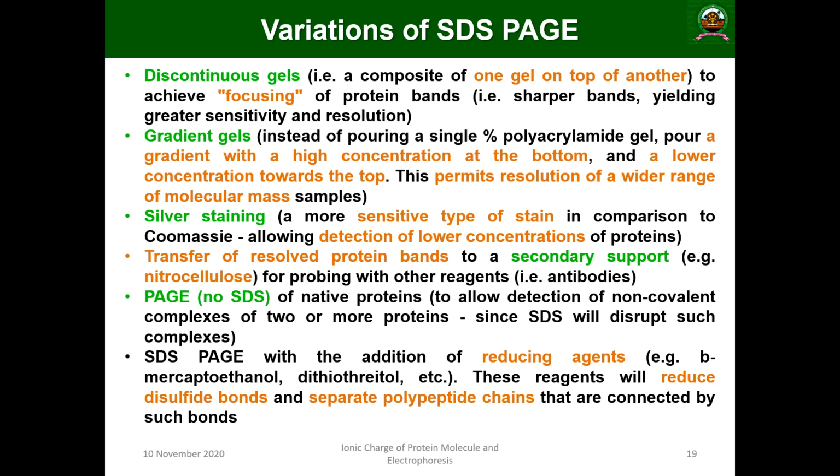Then this is all about SDS page and its variations. There are a lot of variations you can see. One is known as discontinuous SDS page. Here there is a composite of one gel on top of the other, to achieve focusing of the protein bands, which are sharper bands yielding greater sensitivity and resolution.